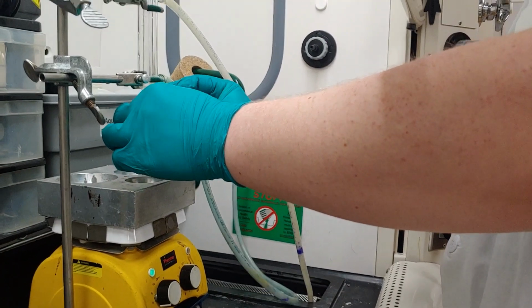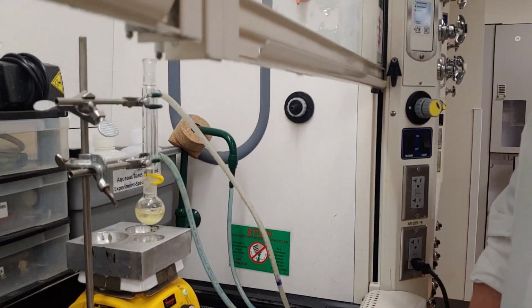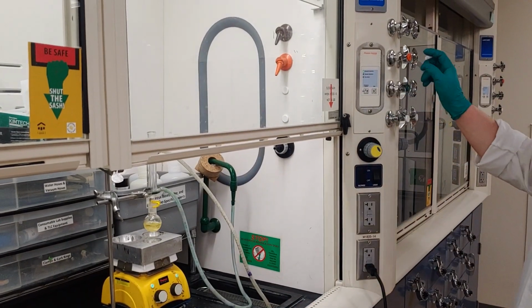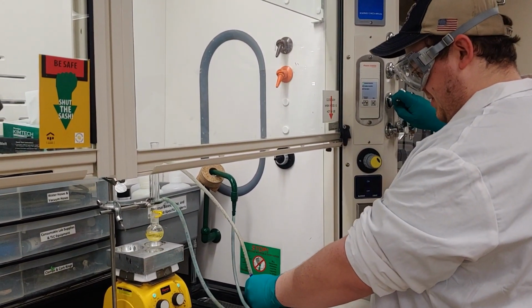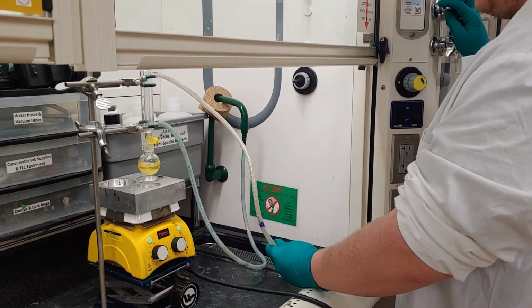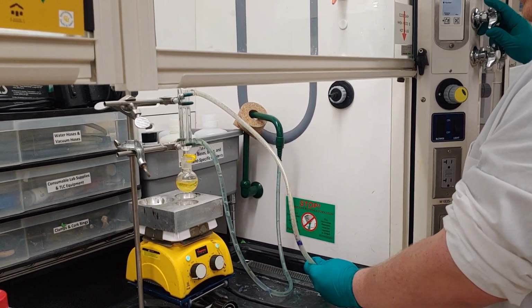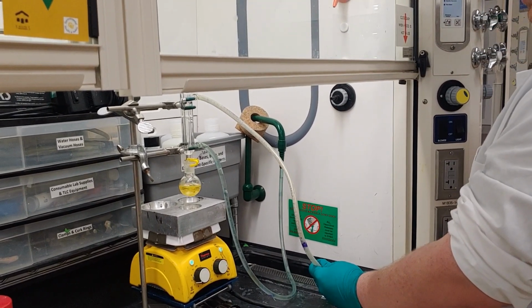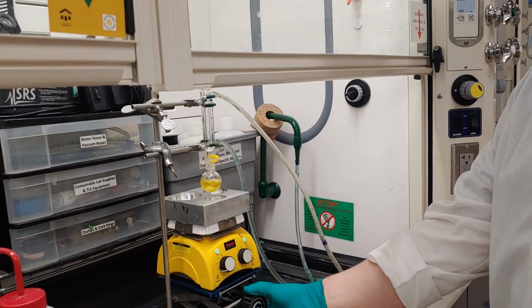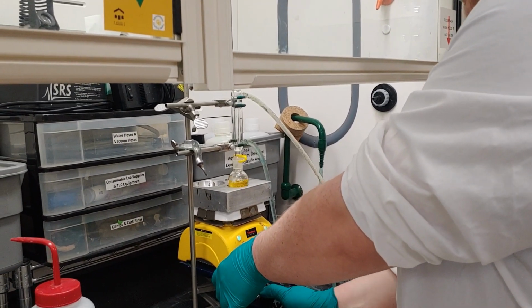And what I want to do here is stir it for a couple minutes, a couple seconds rather, and then start heating it to reflux. So I will first turn the water on, making sure not to spray the lab with a bunch of water. And then I will raise the hot plate up to start heating the flask and refluxing the reaction.